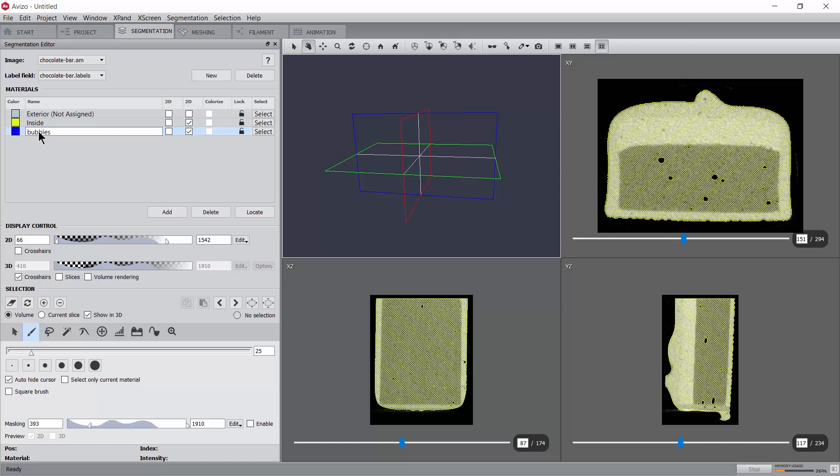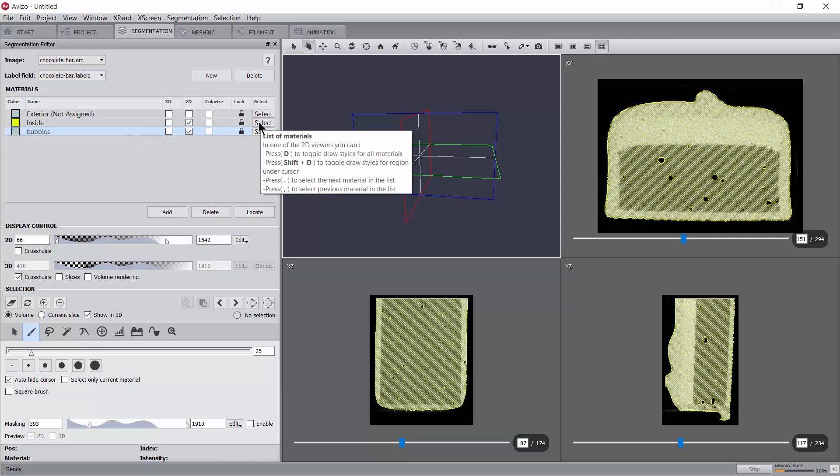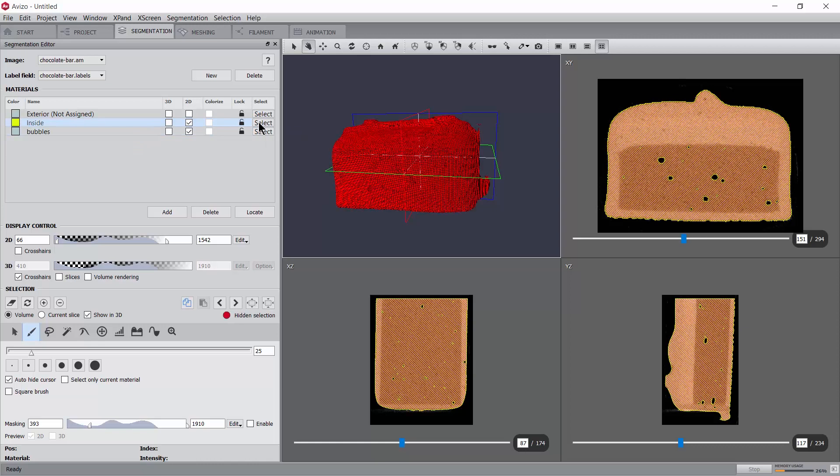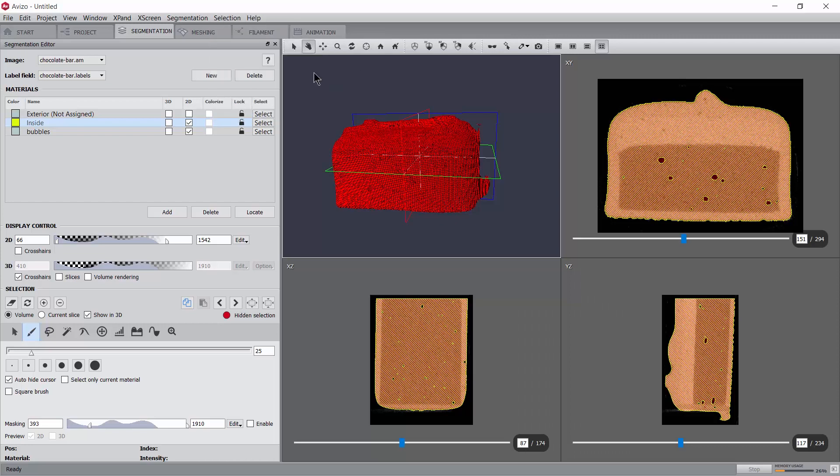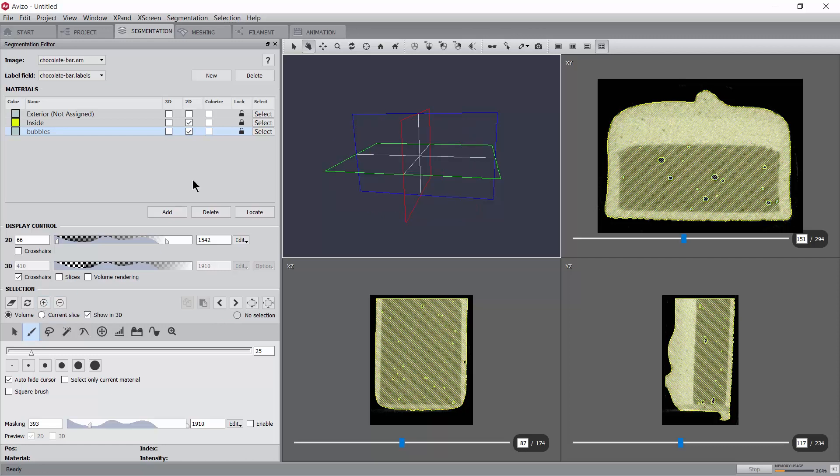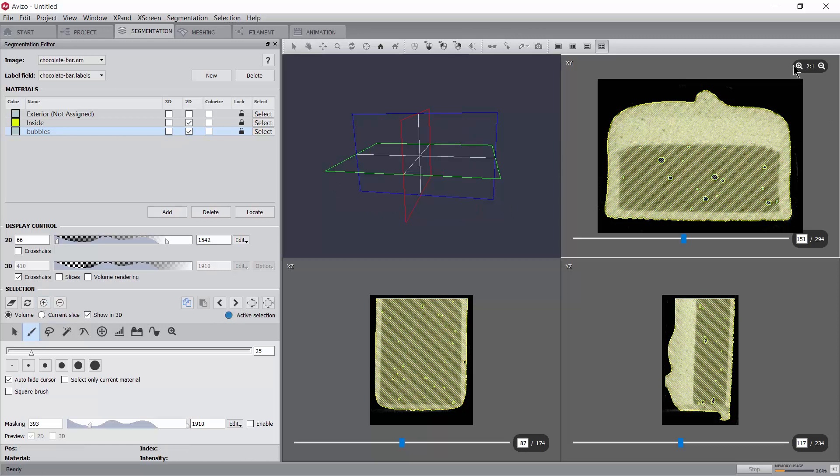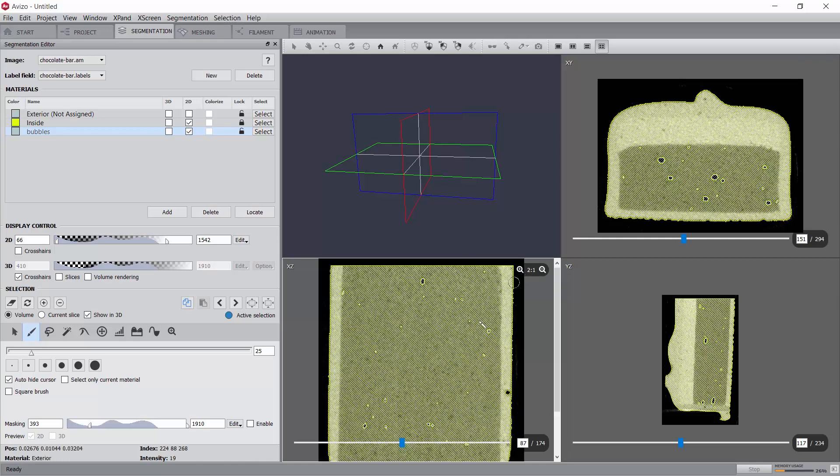In order to select the bubbles, a simple procedure can be to reselect the whole bar and then modify the selection to fill holes in 3D using the menu. If we now lock the material inside and assign the selection containing the bar and its holes into the bubbles material, then only the bubbles get assigned to the new material. As can be expected, the lock option prevents voxels belonging to a material from being relabeled. Don't forget to unlock the materials once you no longer need them locked.